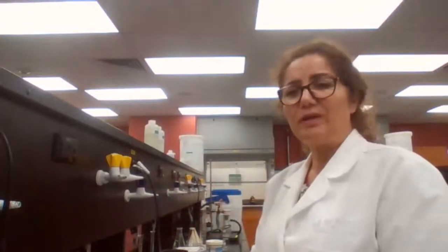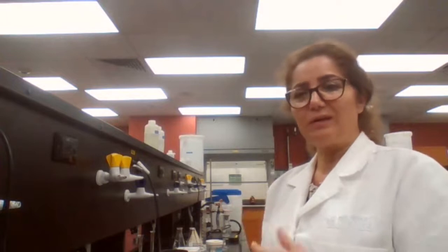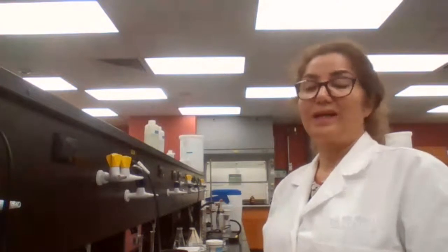The other characteristic that you mentioned is that it should not react with your sample. Like for acetanilide, the solvent that we are using for recrystallization today should not react with it, should not have a chemical reaction, because chemical reactions are irreversible processes. If your compound reacts with the solvent, it's going to generate a new compound that is irreversible by physical means. You cannot get it back to the original compound that you wanted.